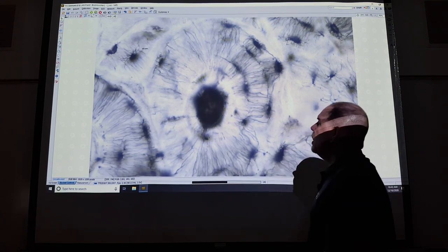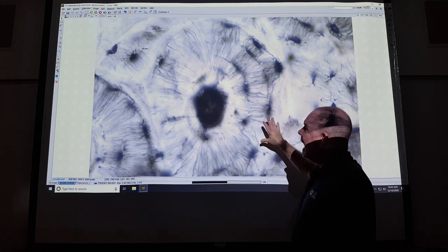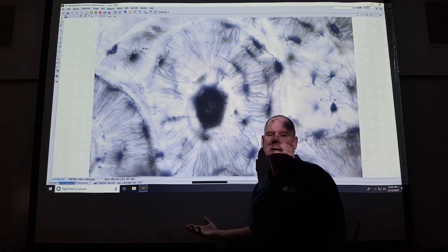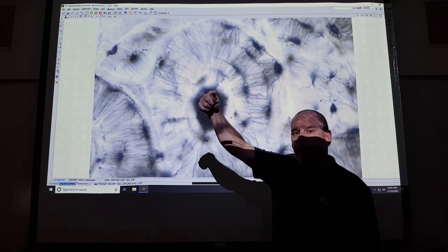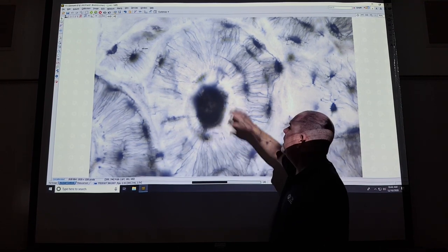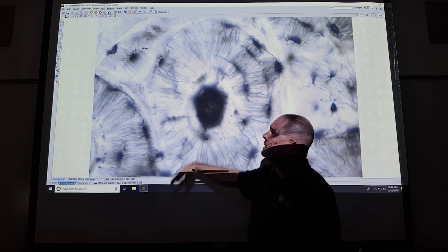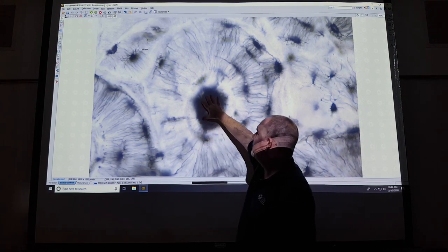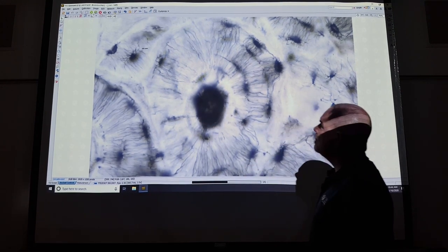Duh. So what we see in this picture is obviously a bullseye of the target, which is called the central canal. There would be blood vessels actually running in this thing out of the screen toward you and back behind the wall in this orientation in a living bone. In this preparation, all the living material is gone and they put ink, India ink, through it, so it fills up with ink here, the empty chambers. So the central canal is the bullseye.